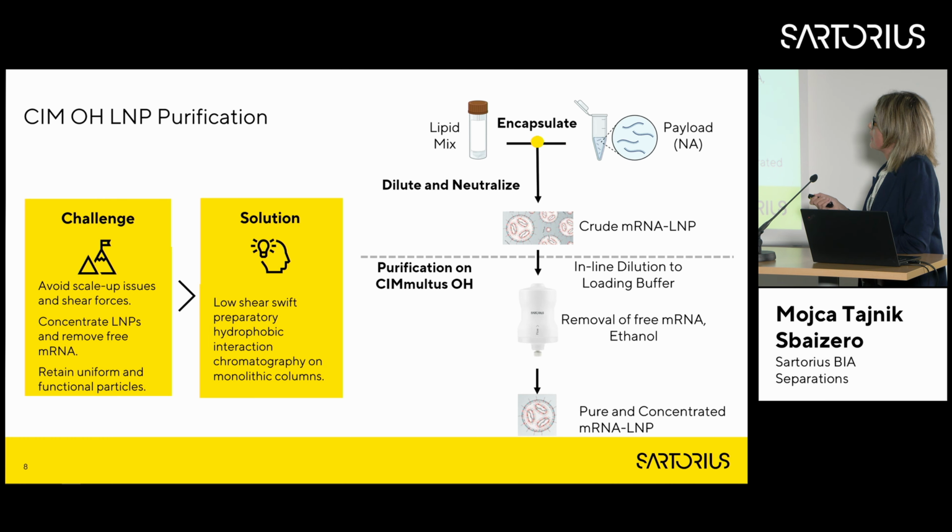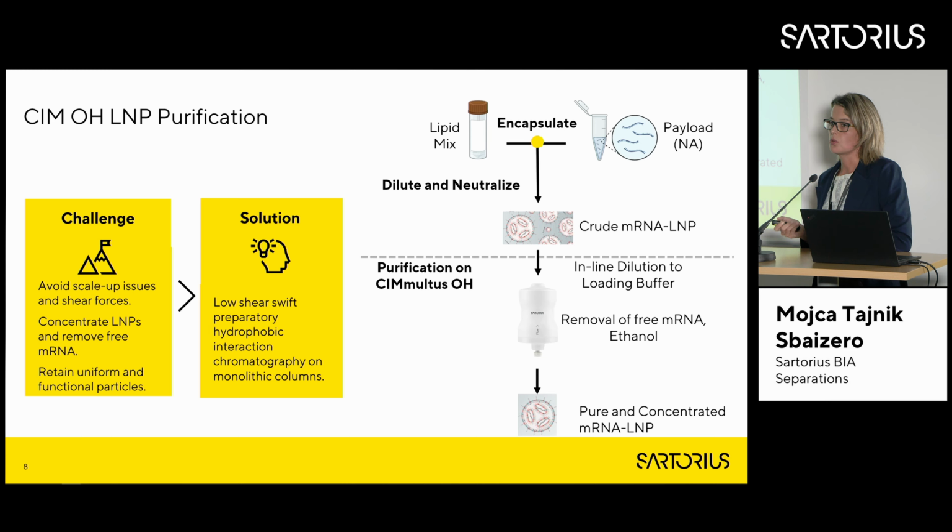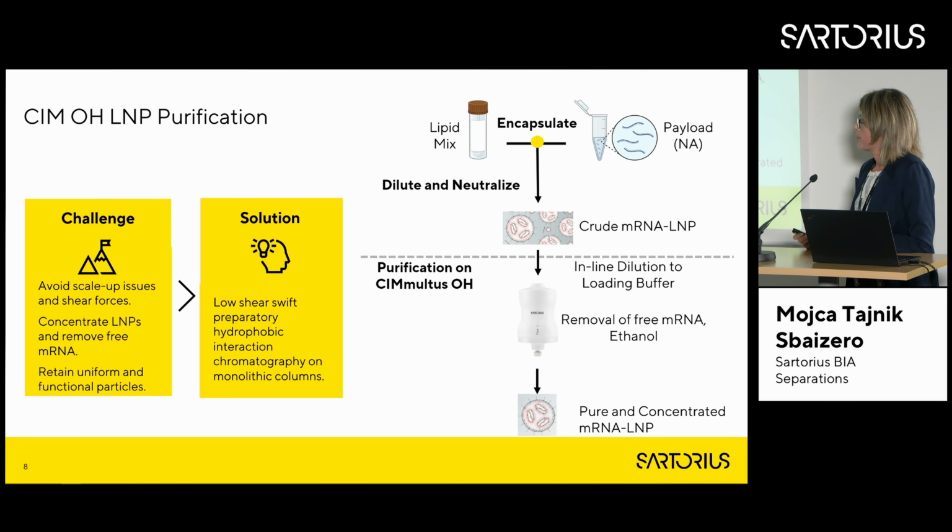But at the same time, we want to keep all the characteristics also on the TFF. So we want to concentrate LNPs, also remove the free ethanol and the free RNA. So we need to maintain actually two different things during the same purification. And we do this with the hydrophobic interaction chromatography.